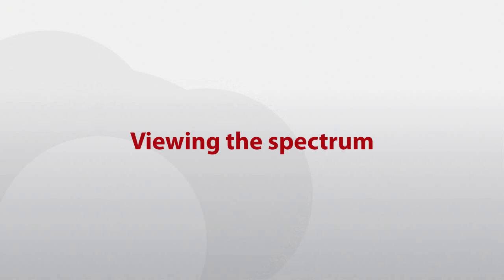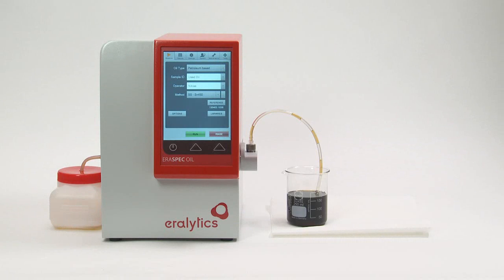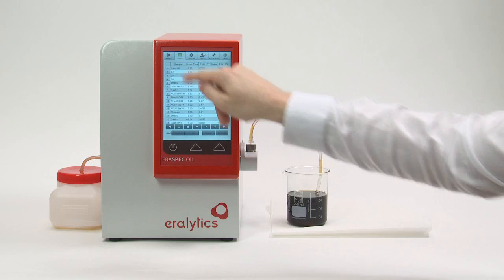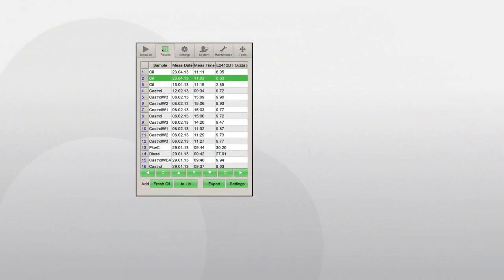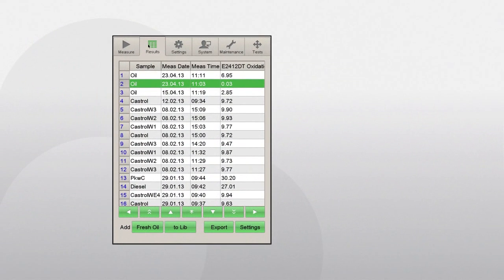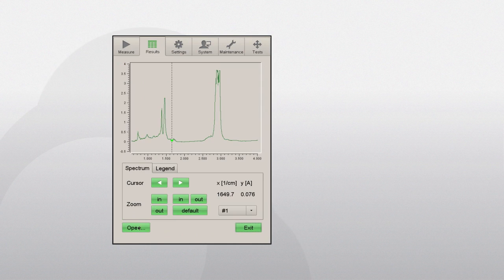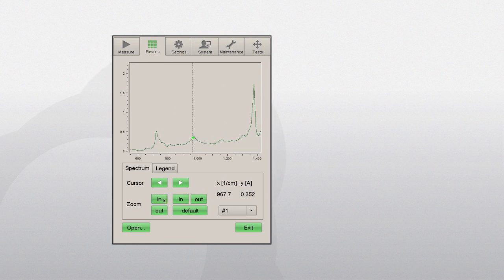To view the spectrum of a measured sample, click the Results tab to see the list of saved measurements. Select the spectrum by clicking the number next to the sample name, then click the Spectrum button. Use the In and Out buttons to zoom.